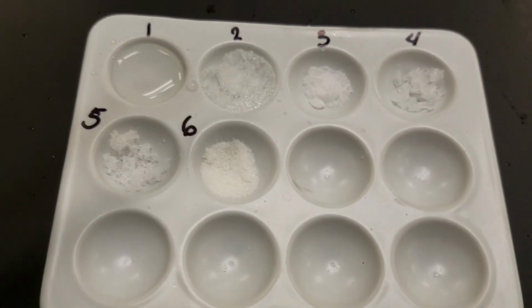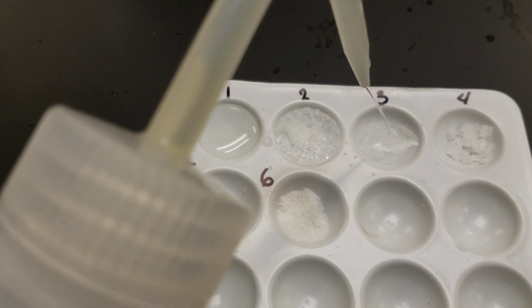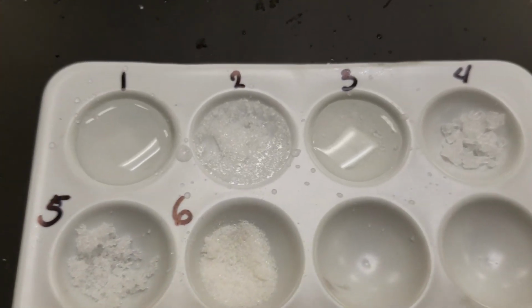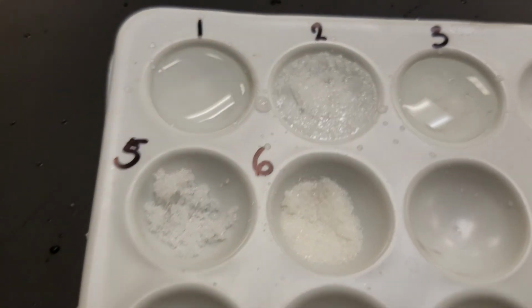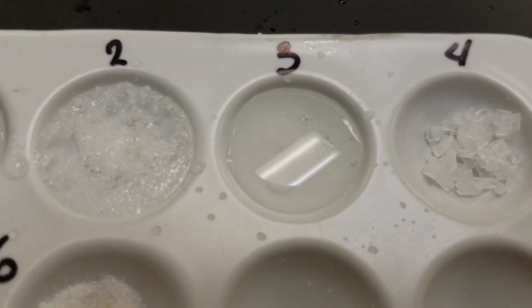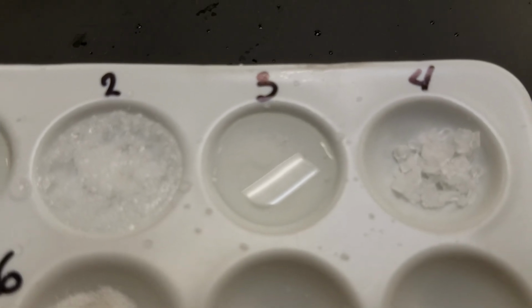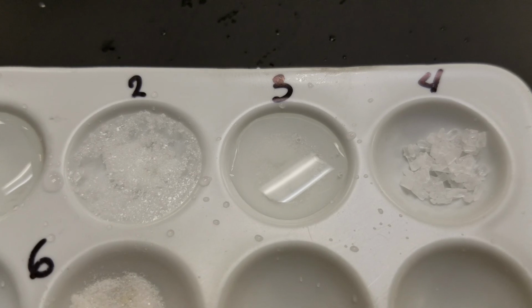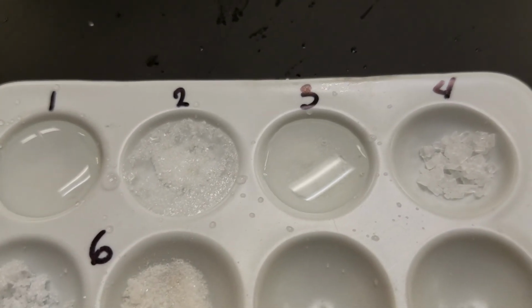Number 3, potassium iodide. There is some that's still left in there. If it dissolved, I don't know if very much dissolved at all. So we could say some solubility.